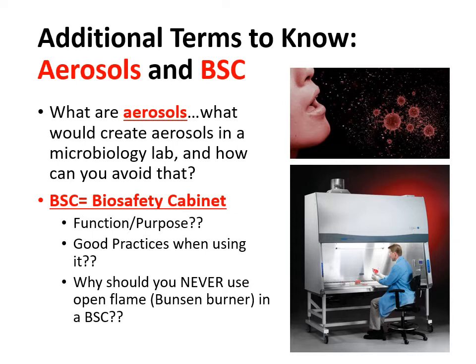One of them is, of course, it's a fire hazard. Okay? It can be very dangerous, especially if the flame gets out of hand or gets knocked over in there. The second reason is that it also damages the filters that keep that BSC working properly. And third, it disrupts the airflow. Again, part of what makes that cabinet work properly is its proper ventilation and airflow. And having a flame in there messing with the oxygen levels can greatly disrupt that. And like I just said, can also damage the filtration of that unit.